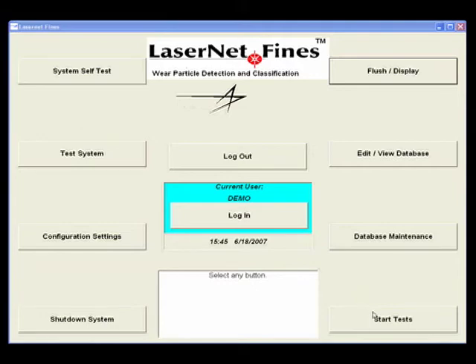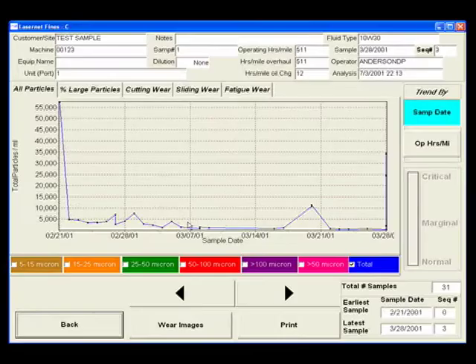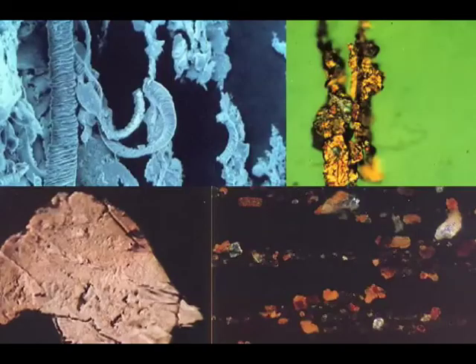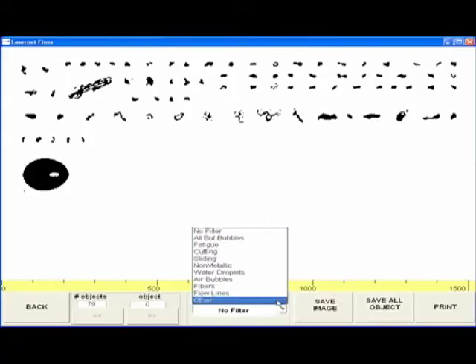The LNF specially dedicated software has been developed by world-class experts in ferrography. From their years of experience of identifying individual wear particles through microscopic images such as these, these experts have been able to generate algorithms capable of automatically classifying particles into the following categories.